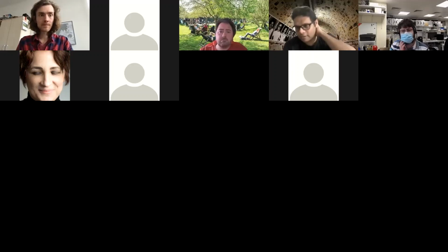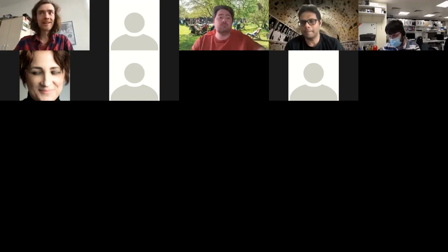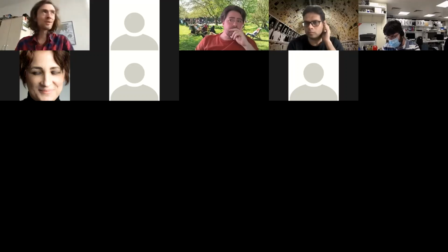So I will take the first from Amirali, and she or he asked, maybe I missed the point, do you install the setup for clients? I think it's so easy that you should do it yourself, right? UC2 setup, I guess she meant. Yeah, we have a number of setups now spread around the world, and one thing we nowadays do is a video, how you call that, Zoom meeting, whatever, to do the last mile.